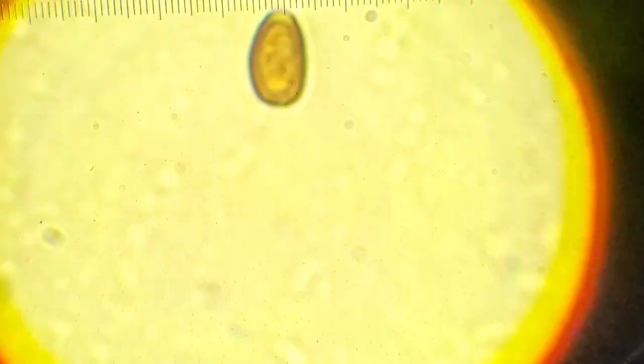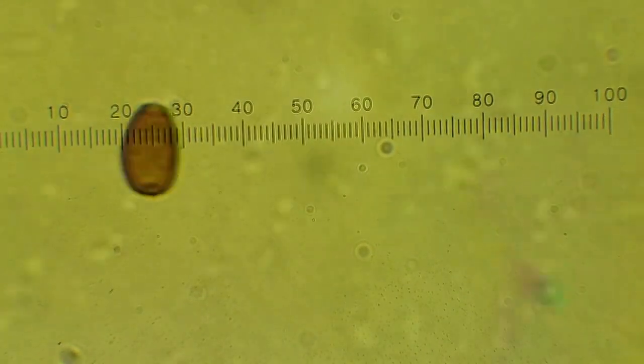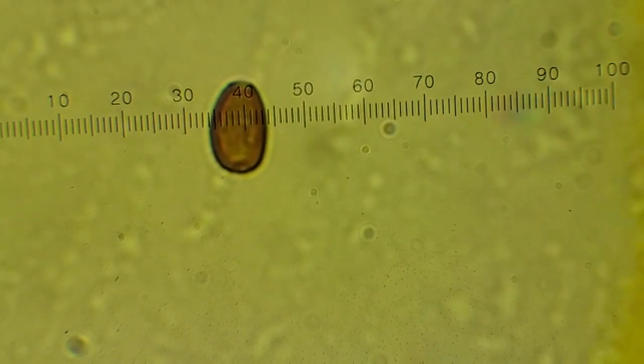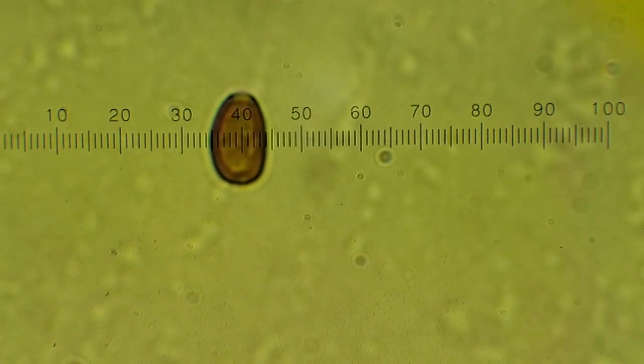Then what you would do is rotate your micrometer, and again find the widest part. Now this isn't perfectly aligned. Let me just rotate it a little bit more. Yep. Then we have to get it to go up because it's not at the widest part. And then you could say it's roughly 9 microns. So 15 by 9.